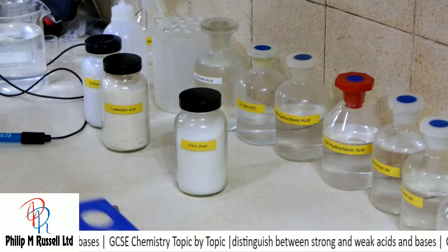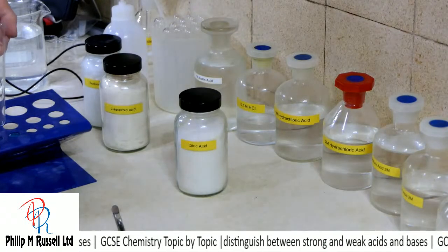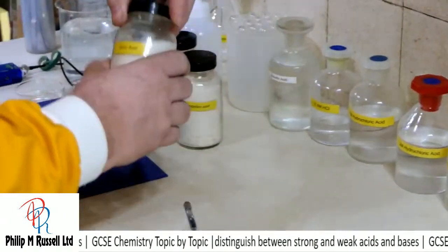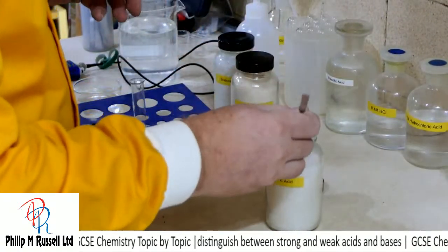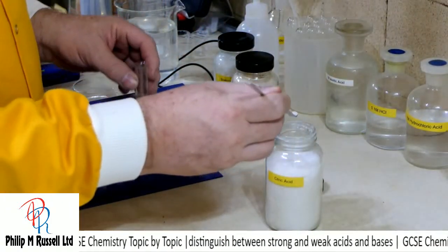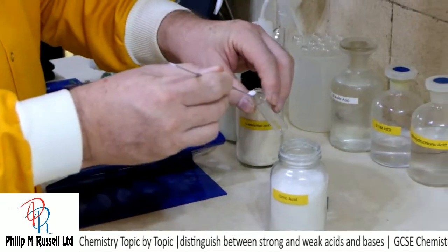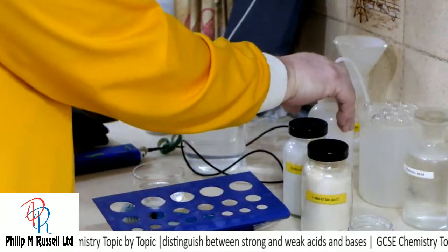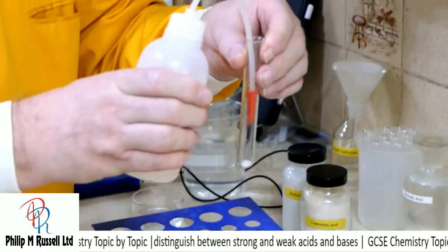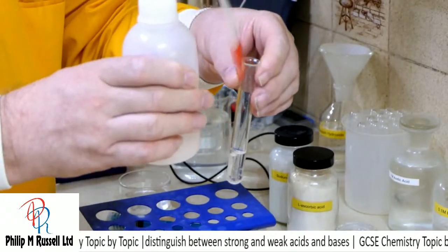So let's get a test tube rack and a test tube, and take a small quantity of citric acid. Hopefully you can see it's just a small quantity that I put in the bottom of the test tube, and we'll add a little bit of water to that.